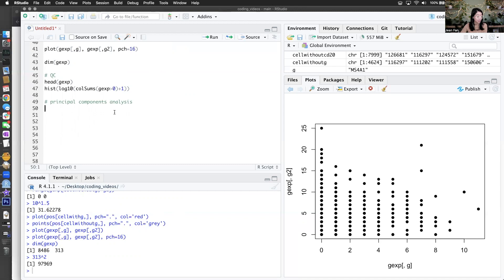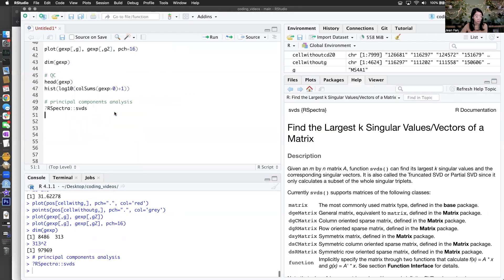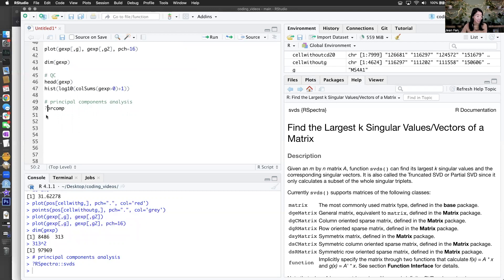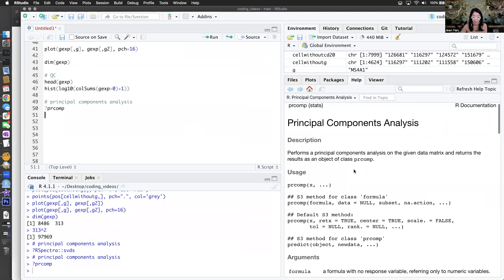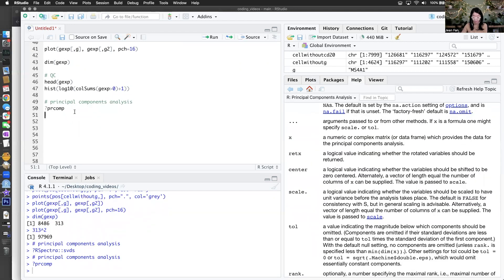If I was doing this for real, I would probably be doing RSpectra or SVDs — that's just a faster singular value decomposition — but we don't want to deal with installing that. So we're using prcomp, which should come standard. We are just going to do prcomp on the gene expression matrix. Can I log it? Yeah, let's log it. I'm not doing any other normalizations right now, just to see how it goes. Okay, that wasn't that bad — thought that would take a lot longer.